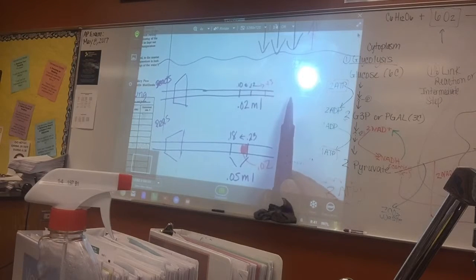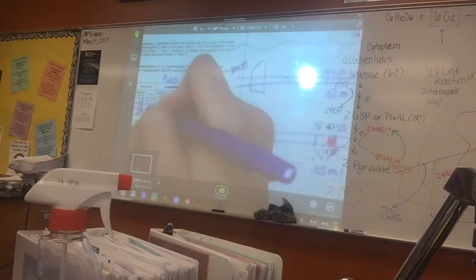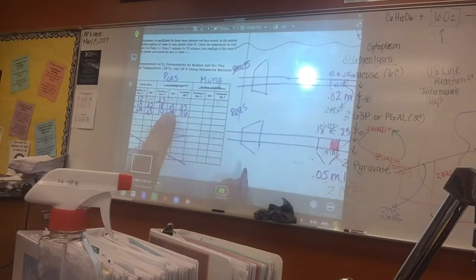Okay, so then you would have a negative number here. If you had a negative 0.01, then you take the difference minus the negative number, so you're really adding it. Does that make sense for the corrected difference?